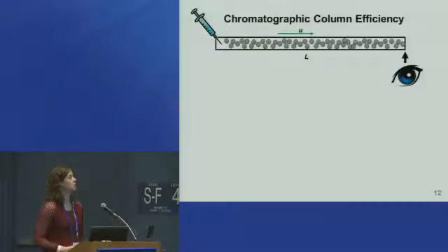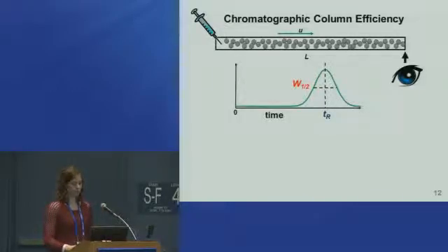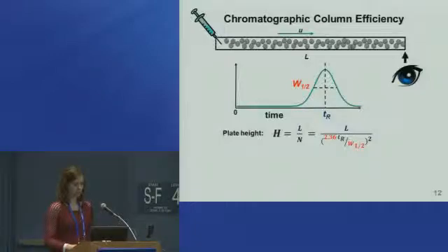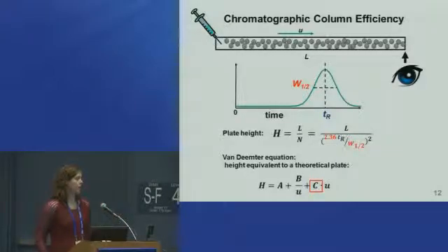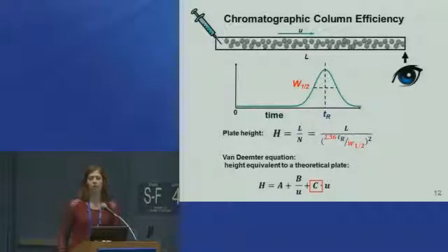What we would like to do is understand chromatography at the molecular scale so that we could describe it from a mechanistic perspective. So to relate in some way the empirical nature of the Van Deemter equation and all of its parameters, as Mary mentioned before, to something mechanistic, so that we could move away from ever having discussions like your experimental plate height makes no sense.